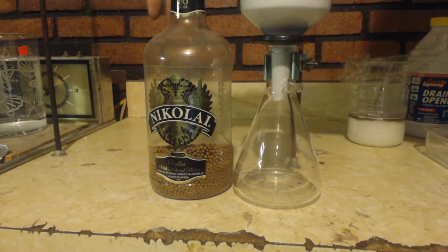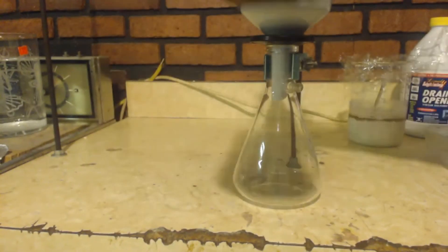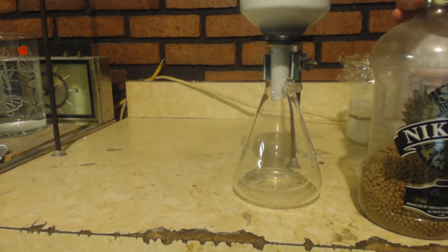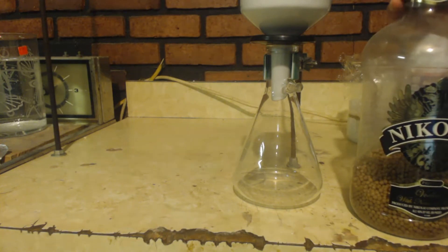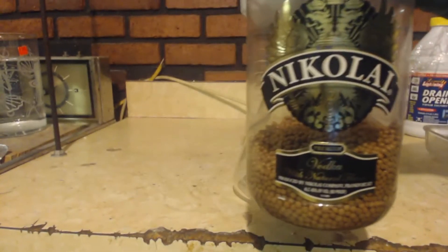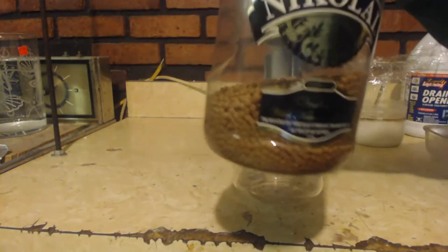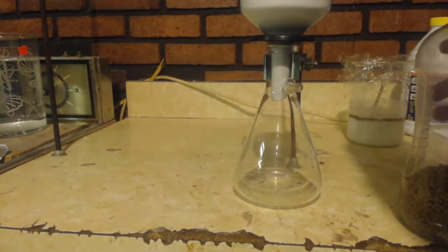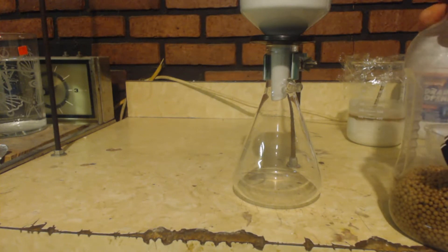I'm guessing I have about 70% of a mole — that's about 100 to 110 grams of product. I don't know the solubility of this product in ethanol, but I'm guessing you can get at least one gram per milliliter of ethanol. So for 100 grams of product, I can probably get it into 100 milliliters of pure ethanol. This is all the ethanol I've got and there's definitely 100 milliliters there.